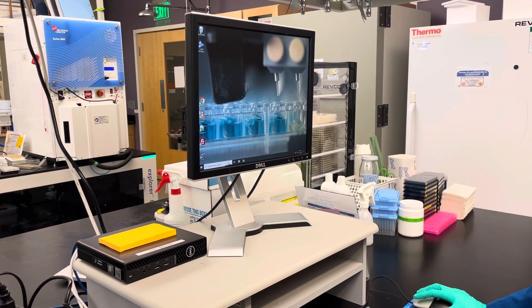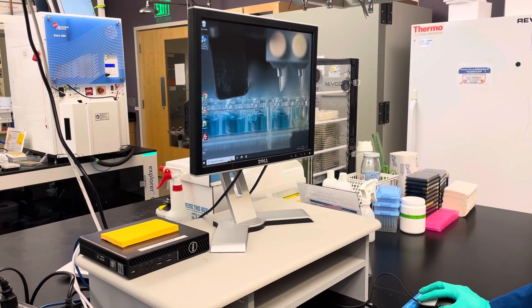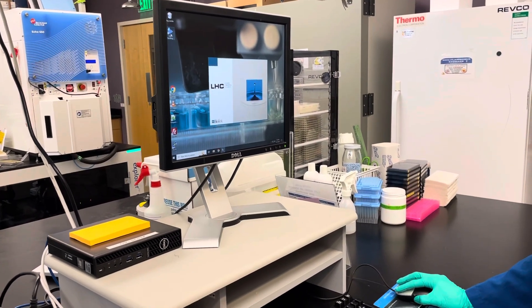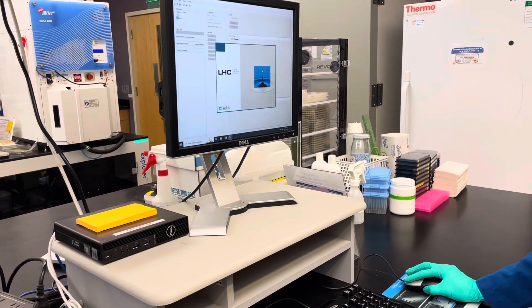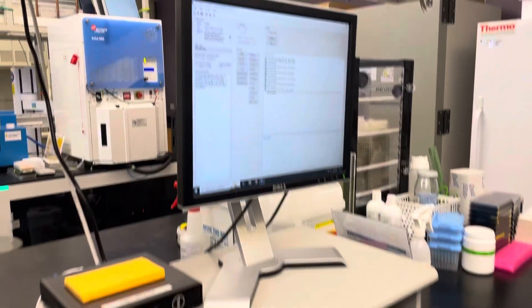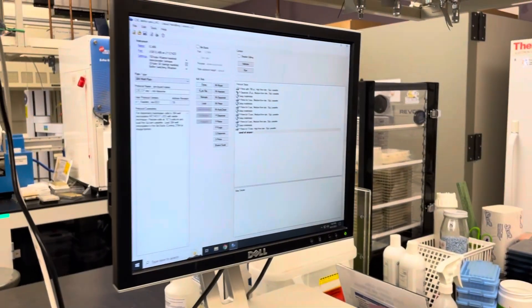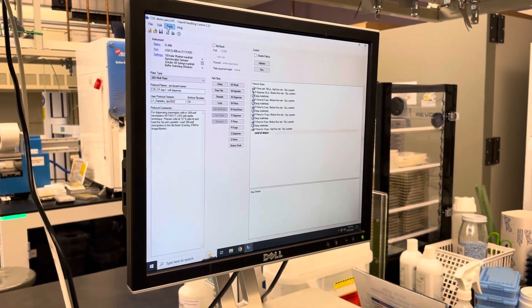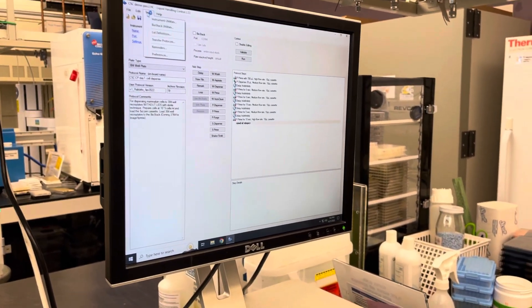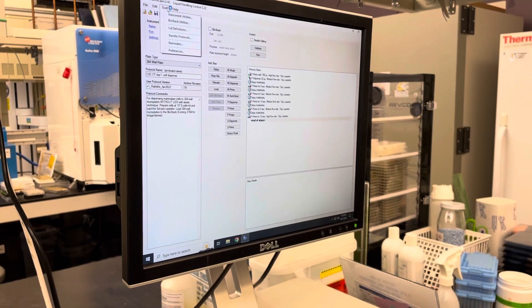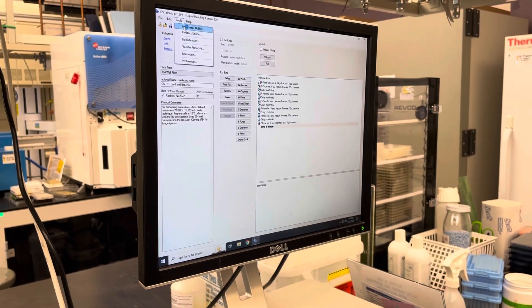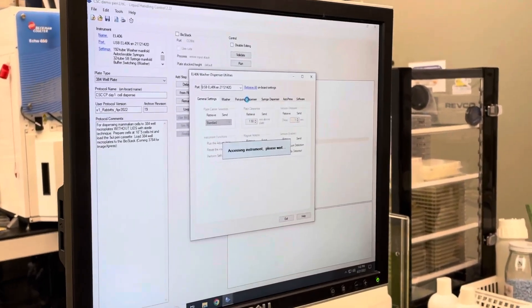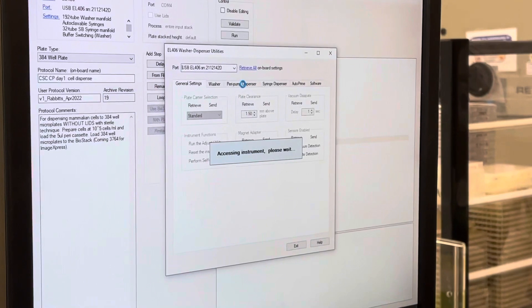The software is called Liquid Handling Control. When you get here, you want to tell it what hardware we're going to load. For that you go Tools, Instrument Utilities, and we're going to use the peristaltic pump.